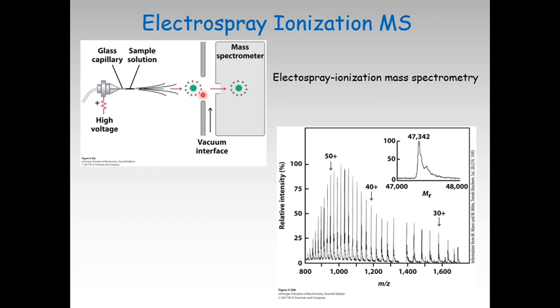The droplets evaporate, and the ions, with added protons in this case, enter the mass spectrometer for M/Z measurement. That's exactly what happens. The output on the right hand side is a spectrum with a family of peaks, with each successive peak from right to left corresponding to a charged species with both mass and charge increased by 1.